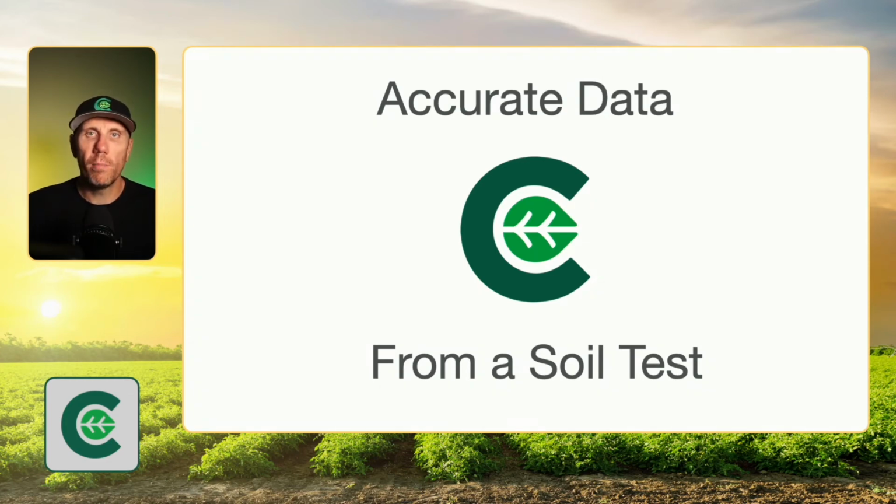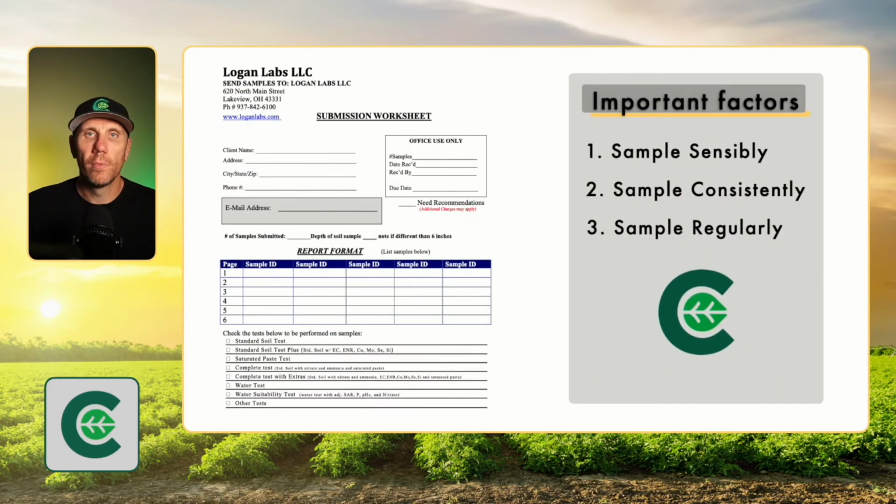I wanted to take a minute to explain how to get accurate data from the soil testing procedures. The first important consideration is that you're testing sensibly. If plants are performing poorly in one section and performing better in another section, it would make sense to sample those separately. If you have two different areas that are performing differently and you combine those samples, you're going to be skewing both data sets, which will ultimately negatively affect the overall amendment procedure.